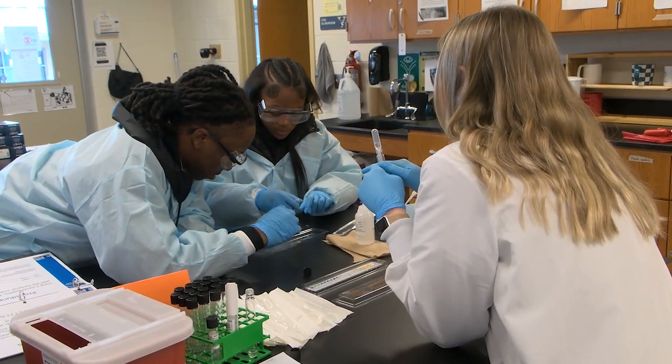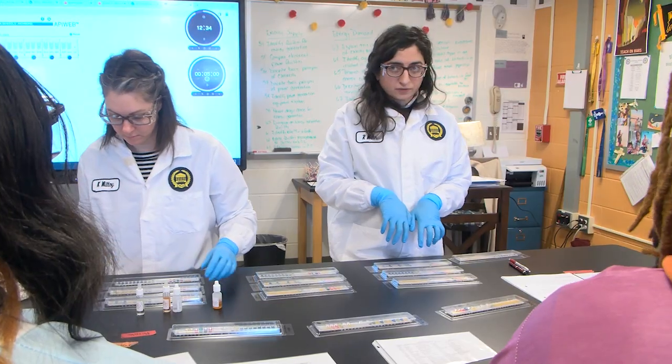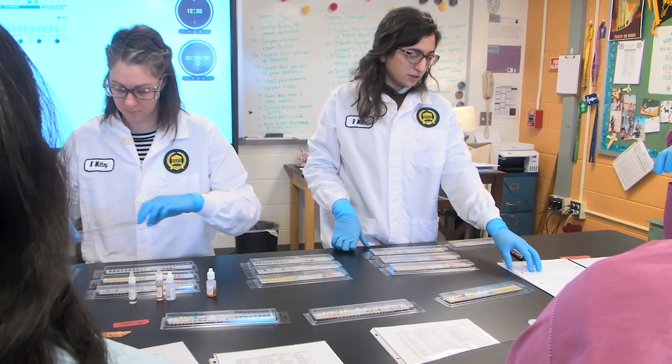That's called an autoclave. We have some other topics that we haven't quite covered yet. One of them is DNA and genetics, so very soon we do plan on meeting with them again and trying to tailor another experience. To be able to identify what bacteria we're working with.